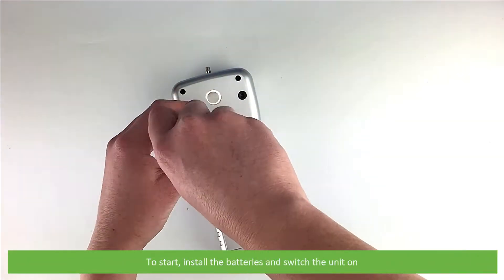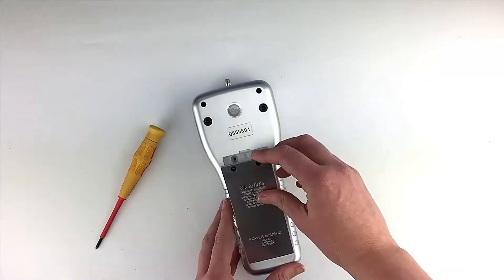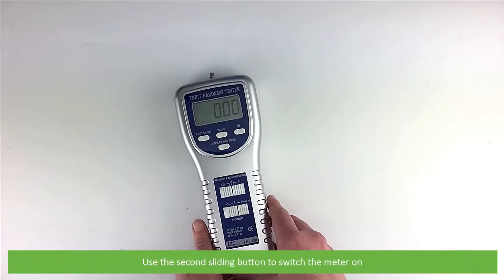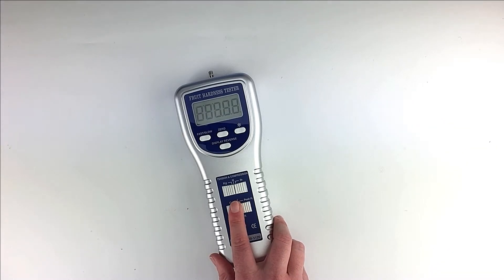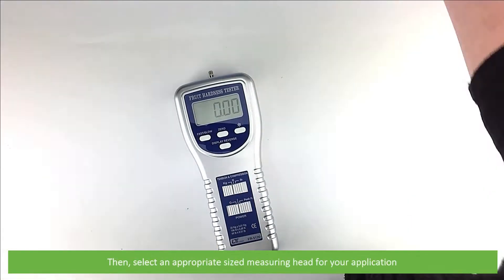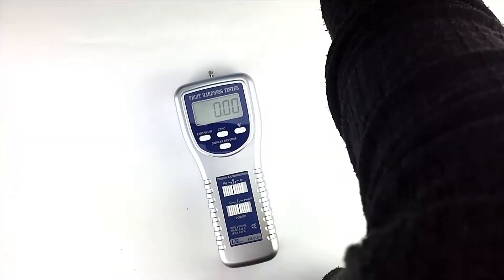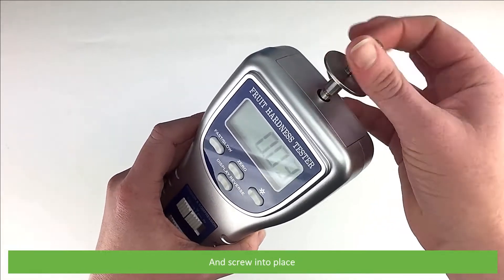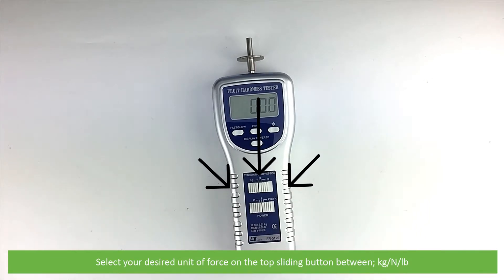To start, install the batteries and switch the unit on. Use the second sliding button to switch the meter on. Then select an appropriate size measuring head for your application and screw it into place. Select your desired unit of force on the top sliding button between kilograms, Newton, and pounds.